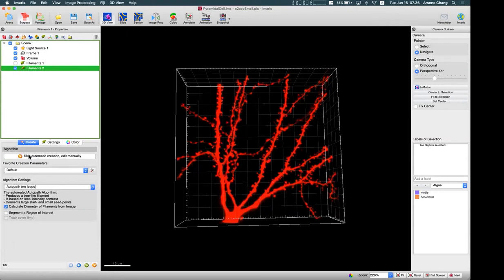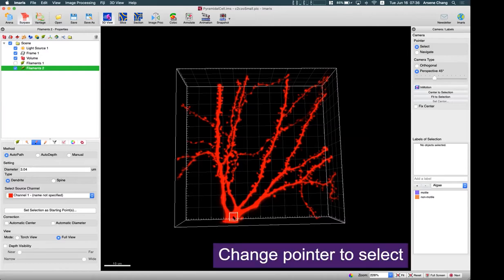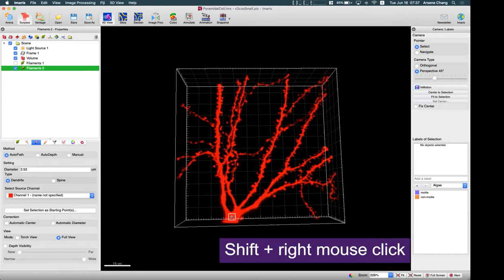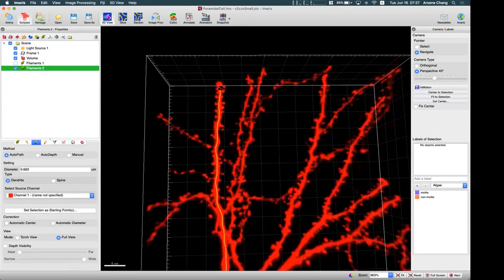For example, if you add a filament again and skip automatic creation, it will lead you directly to the Draw tab. From there you can start with auto path. To begin tracing, switch your mouse pointer to select mode, then hold Shift and right-click to place the starting point. As you move your mouse along the dendrites, the tracing route already shows, because Imaris compares the intensity of the voxels between the pointer and the starting point.